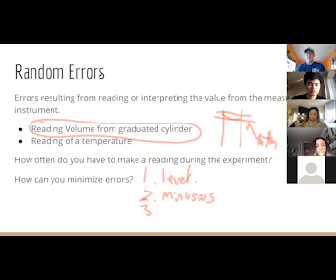It's just as important as these other two. I'll put it this way. When you're reading it, where should you be in relation to the graduated cylinder? Right in front of it. Not only right in front of it, but where? Above it? Below it? Level with it. At the very same level, right? So it may look kind of silly sometimes. You see people in the lab at the bench getting down on their knees. But you've got to do that.